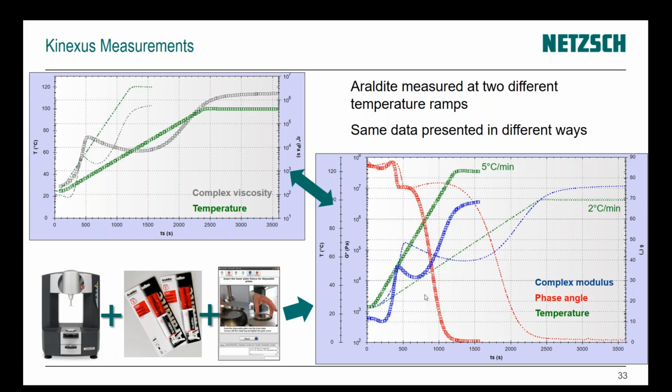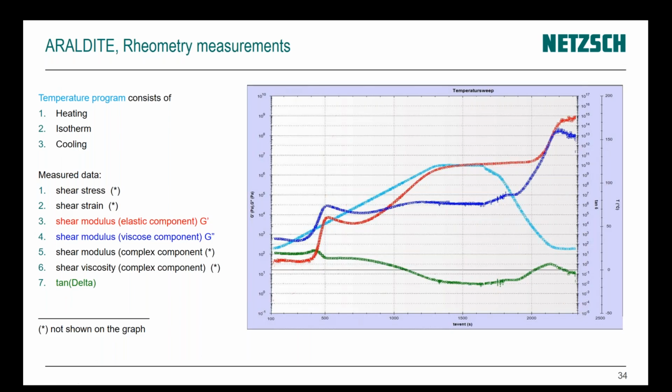And that's where what we're going to do now is take this data, transfer it, import it into Kinetics Neo, model it up, and let's see what happens. Which brings me over to my colleague Elena again to take it from here.